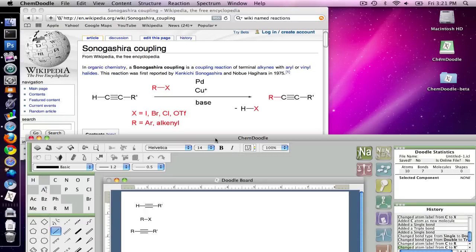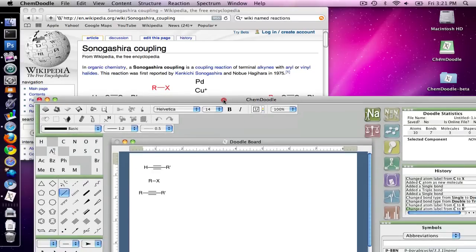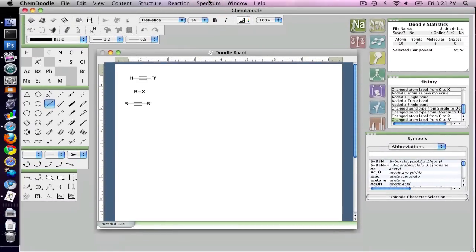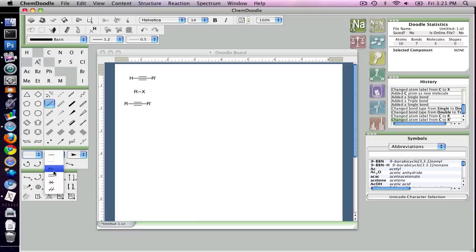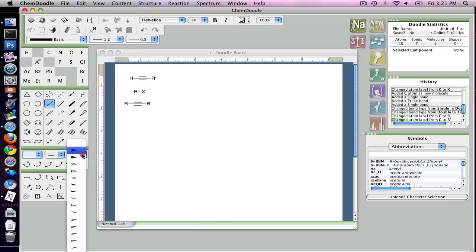Now that the reactants and the products are drawn, I can add the arrow. We have a new arrow toolbar down here which allows us to quickly set up our arrows, and just to demonstrate, I want to do very quickly an equilibrium arrow, so I'm going to choose the double line connector.